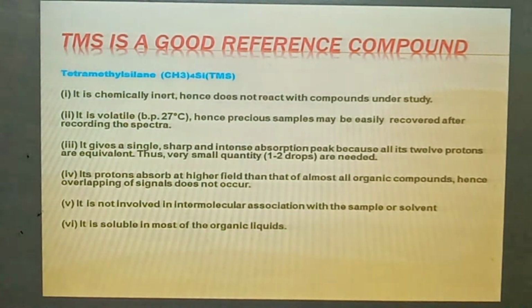From that 0, all the different types of protons are differentiated. Protons may be available in the form of alkanes, alkynes, aromatic protons, and functional group protons such as aldehyde protons. The zero is nothing but the absorption position of tetramethylsilane, and the measurement is carried out in NMR in parts per million, ppm, based upon the magnetic field strength applied in the NMR instrument.